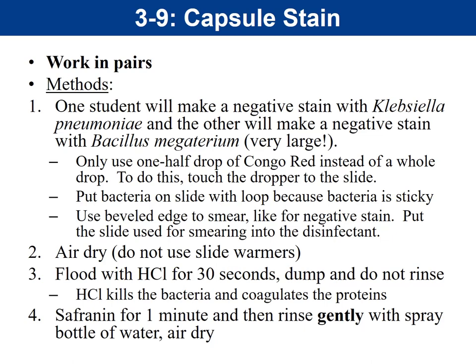Notice the beginning is exactly like the negative stain — you want the background stained so you can see the colorless capsule. Don't forget to put the smearing slide into the disinfectant, and air dry the slide — no heat, so don't use slide warmers. Then flood the slide with hydrochloric acid for 30 seconds; let it sit, then dump it off but don't rinse the slide. The hydrochloric acid kills the bacteria and helps coagulate the proteins, similar to the heat-fix step but without the heat.